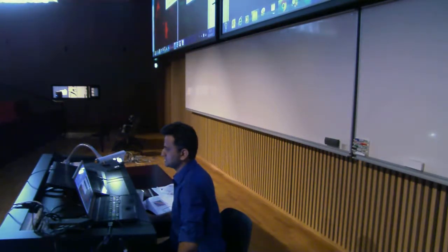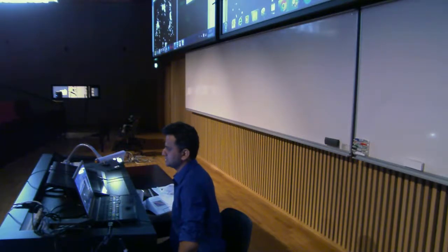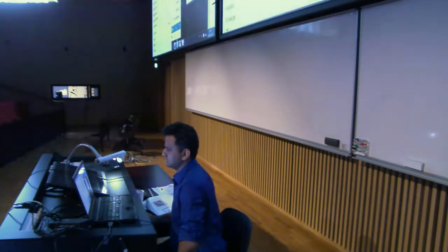Oh, active image does not have a selection. Why is that? Okay. Say light and go to ROI manager. Active image does not have a selection. Okay, because of the selection mode.